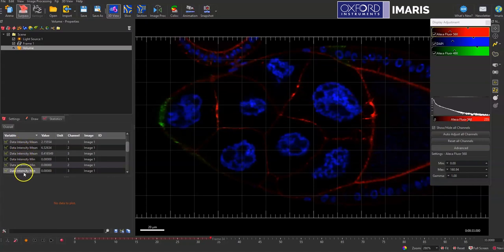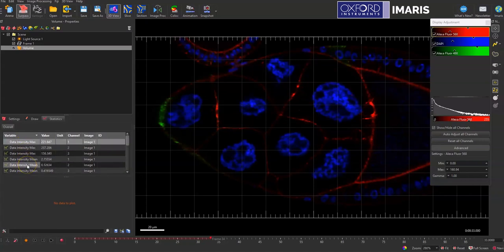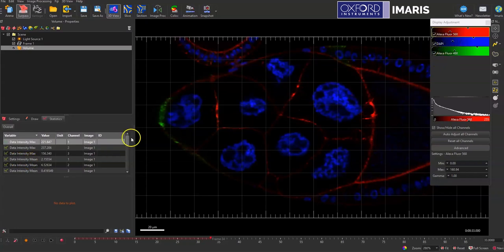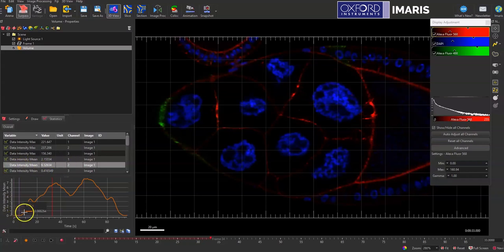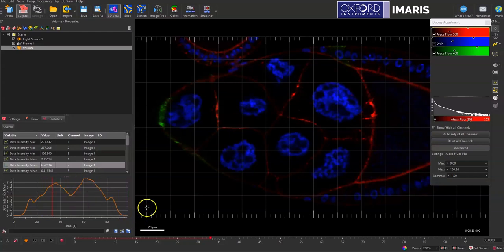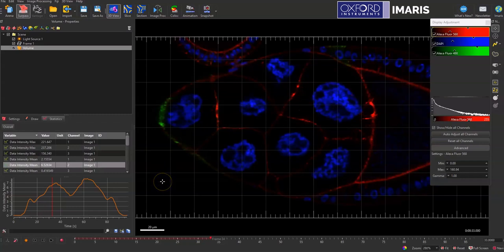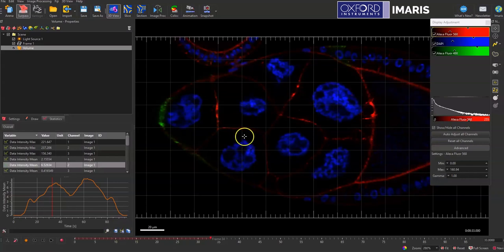And so if I wanted to do the intensity mean of the blue channel across the different Z planes, I can just select this specific statistic for channel 2 and you can see that it exports intensity mean and how that changes across those different Z planes over the mock time lapse, and I can export this using the different export options in IMARIS.